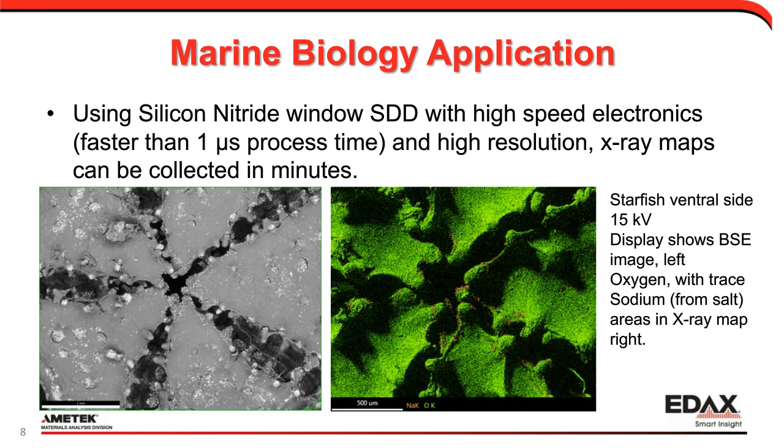Now we'll move on to a really interesting softer tissue sample. So this work came about a number of years ago when we had a user school attendee from Montana State, and he talked about a grass called horsetail. And this is a grass out west which has silicon in it. And the reason that silicon was in it, it was two reasons.